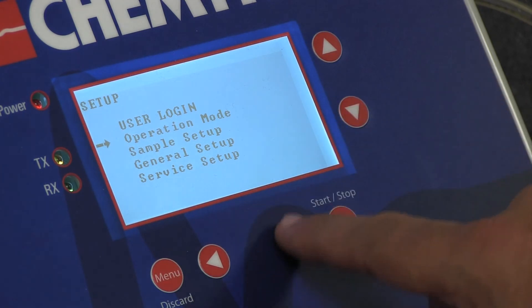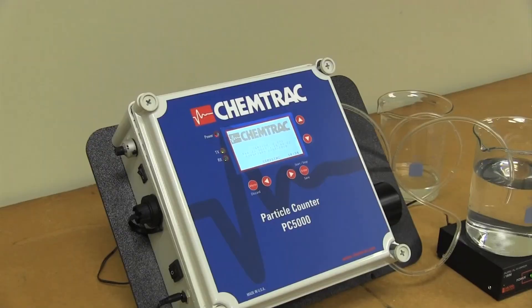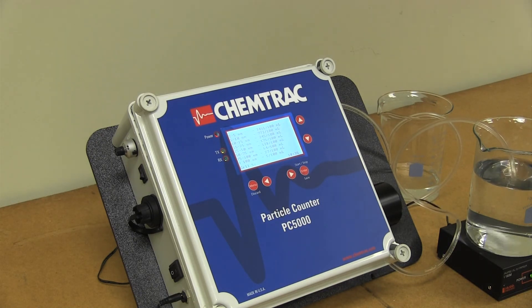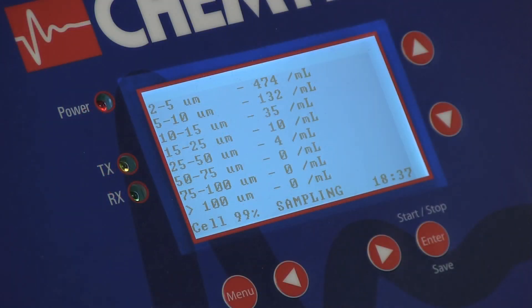The operation mode can be changed from grab sample runs to online continuous. Manually turning on the pump will allow for a continuous flow of 75 milliliters per minute. The typical sample frequency is every 60 seconds, and the typical sample period is 15 seconds. The results are updated each minute, and from minute to minute are quite consistent.